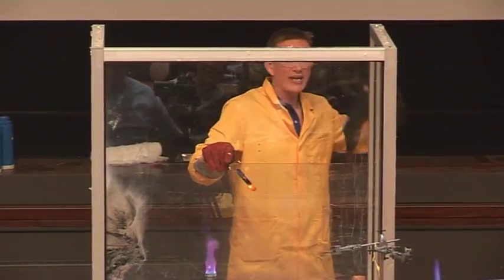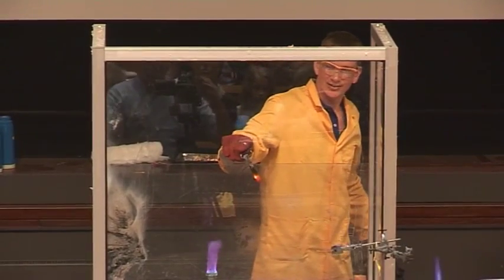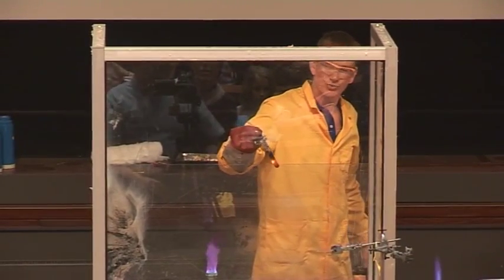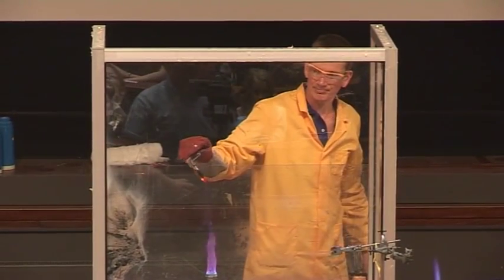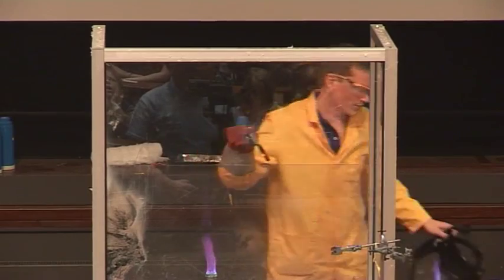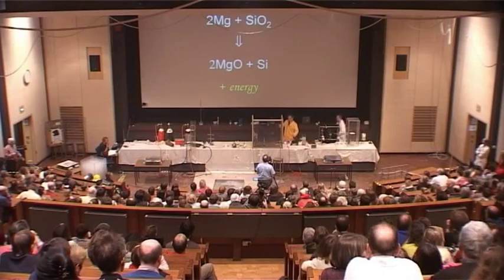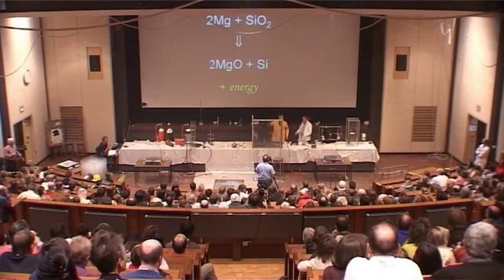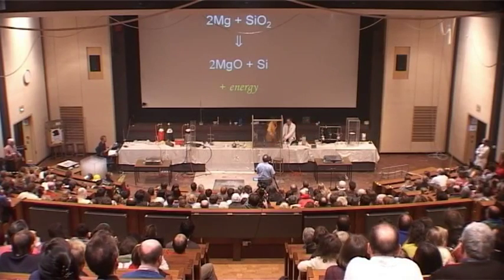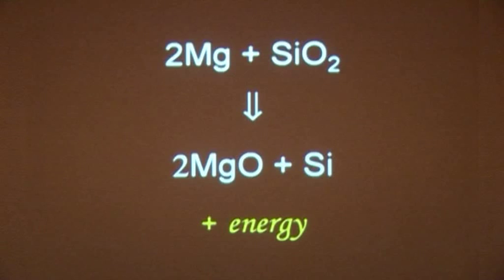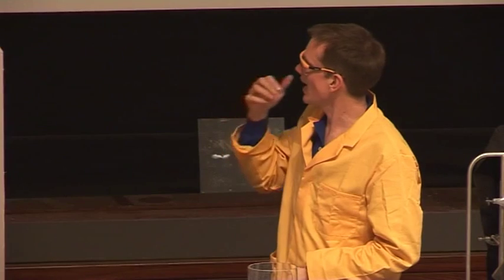Even sand reacts with burning magnesium. Now, what do we get when this reacts? Magnesium and sand — the magnesium steals the oxygen from the sand, or the silicon dioxide, and initially forms silicon and magnesium oxide.